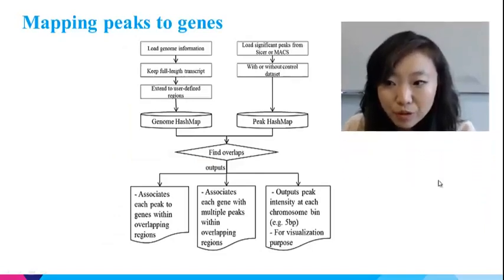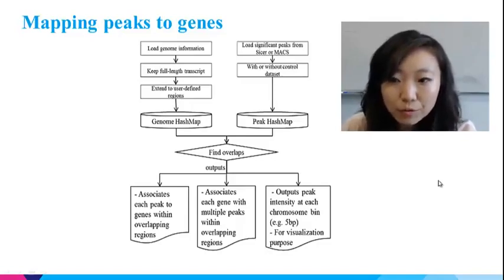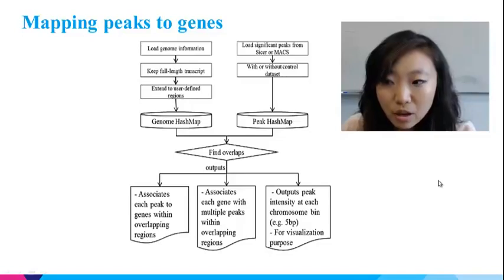It's time to choose your favorite programming language and brush up your coding skills. The workflow is the one I've used. I put it here as an example for your reference. I encourage you to develop your own workflow according to the specific biological questions you try to answer with the ChIP-seq experiments. Since I'm not interested in the difference between isoforms, I use the longest transcript to represent the gene.